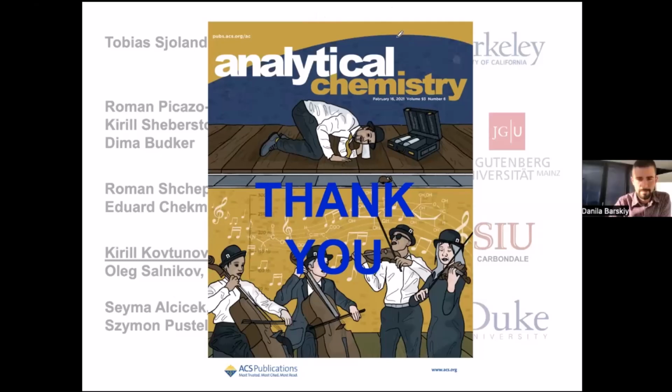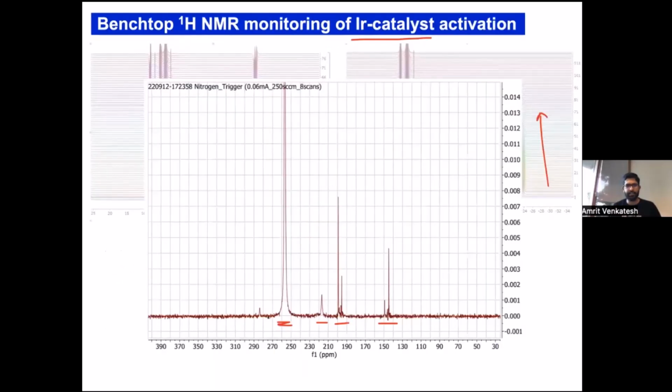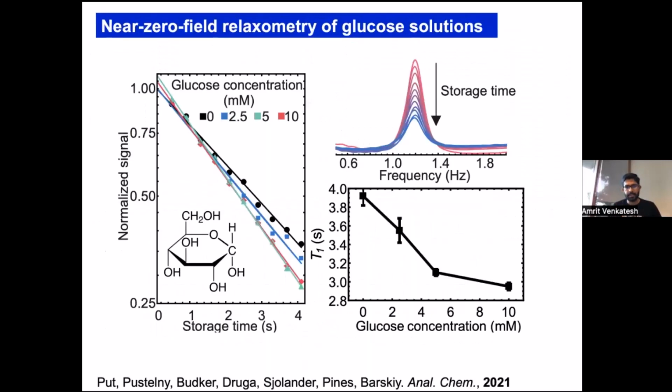So I was curious if you could share some thoughts on what the challenges are with applying some of these techniques, especially the SABRE relay method that you were showing, and doing all this cool benchtop NMR spectroscopy, also at high field? Is that something that you have tried?